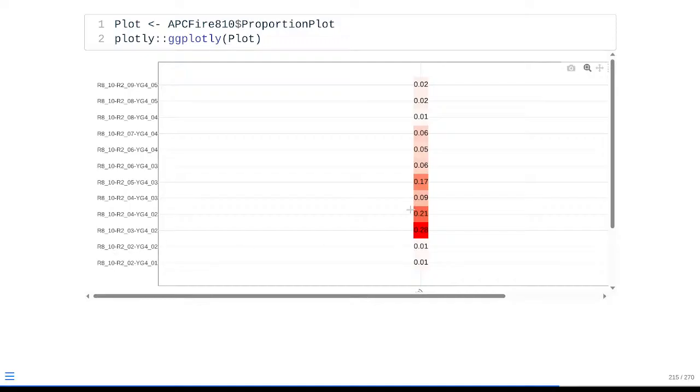But then we have a good chunk of cells that are somewhere in the middle, with the R2 detector contribution from APC ranging from anywhere from 30% of the peak detector to like 50% of the peak. This looks to be about 70% of cells in this intermediate range, but then cells that have a severe amount of APC present on the surface are maybe another 20% of cells. So substantial enough that we're able to see it across the board.